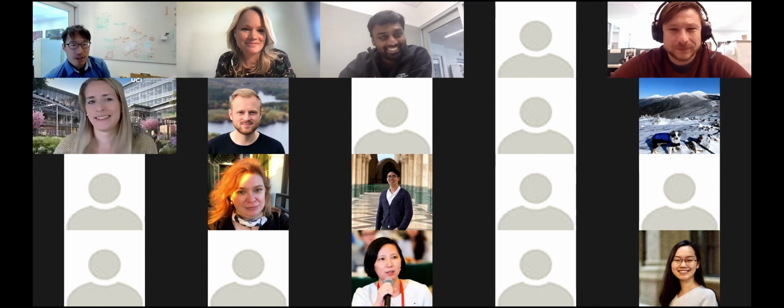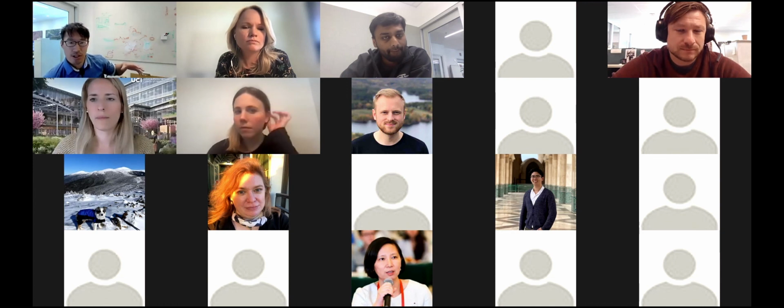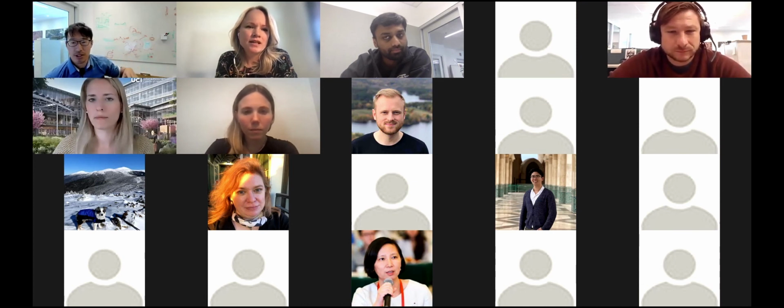My question was actually more about the image acquisition setup, also the microscopy setup that you had. So is that from a confocal, because they were very high resolution images that you sent? Okay. Yeah. Oil immersion. 63x. Oil immersion. How are those images directly translatable to training another model that maybe you want to apply on lower resolution images? And if not, would one have to repeat the exercise on lower resolution images?